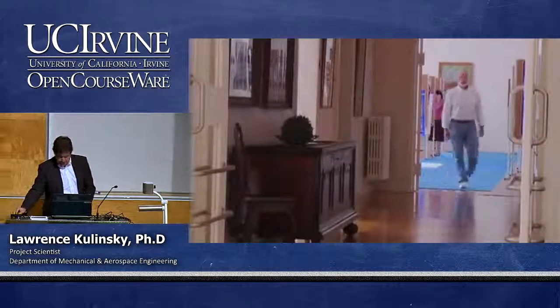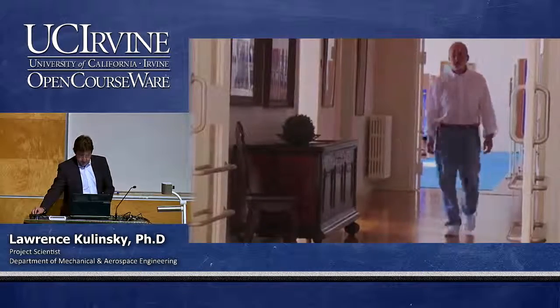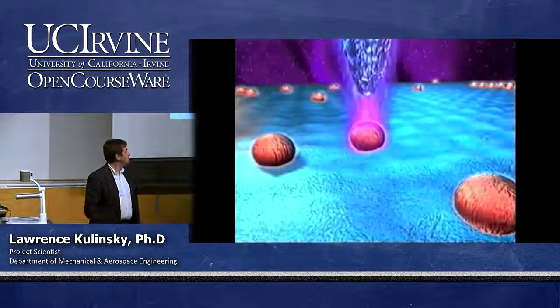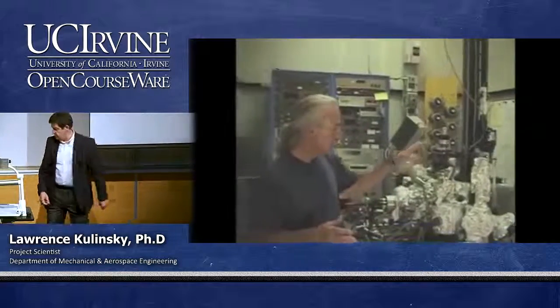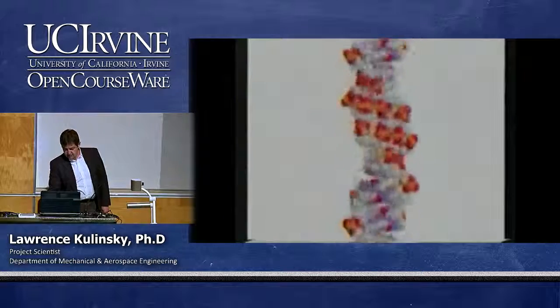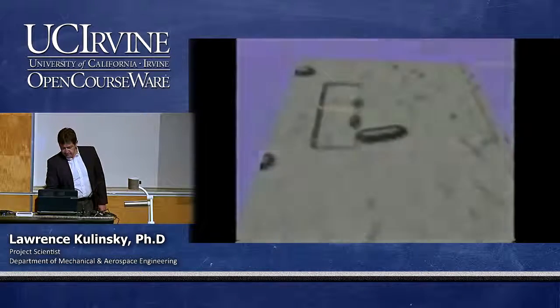20 years ago, IBM fellow Don Eigler's discoveries changed the course of nanotechnology. September 28, 1989, Don Eigler became the first person in history to move and control an individual atom. Shortly thereafter, with the help of a custom-built microscope, he and his team spelled out the letters IBM using individual atoms, signaling a quantum leap forward in the field of nanotechnology.